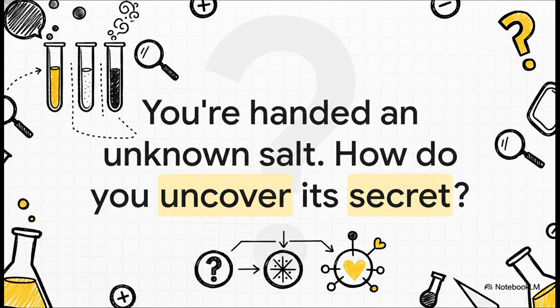What do you do? Do you just start mixing things randomly and hope for the best? Absolutely not. In qualitative analysis, every single test is a deliberate step. It's a question you're asking the substance, and the reaction you see? Well, that's its answer. And it's another clue that gets you one step closer to solving the mystery.